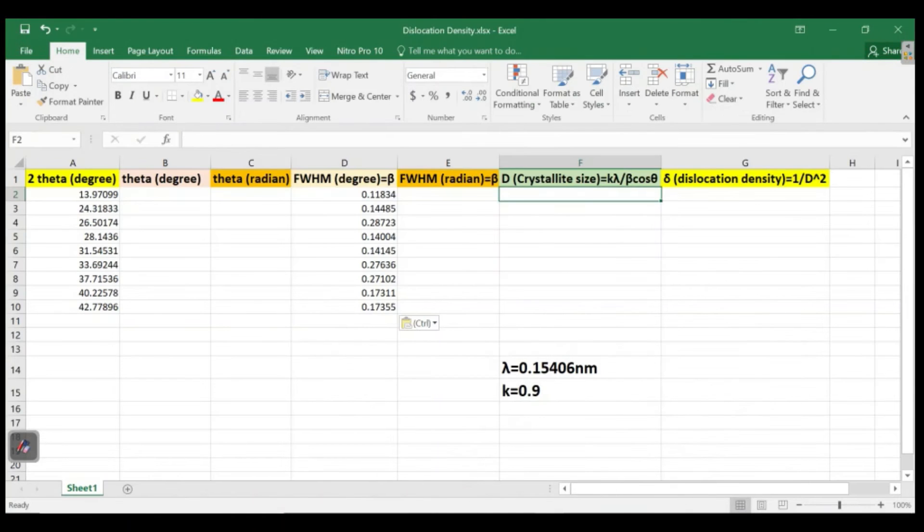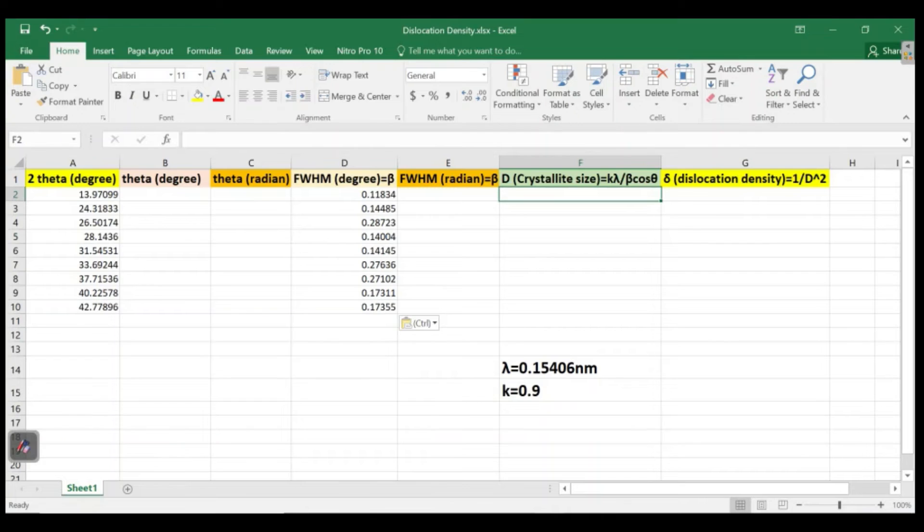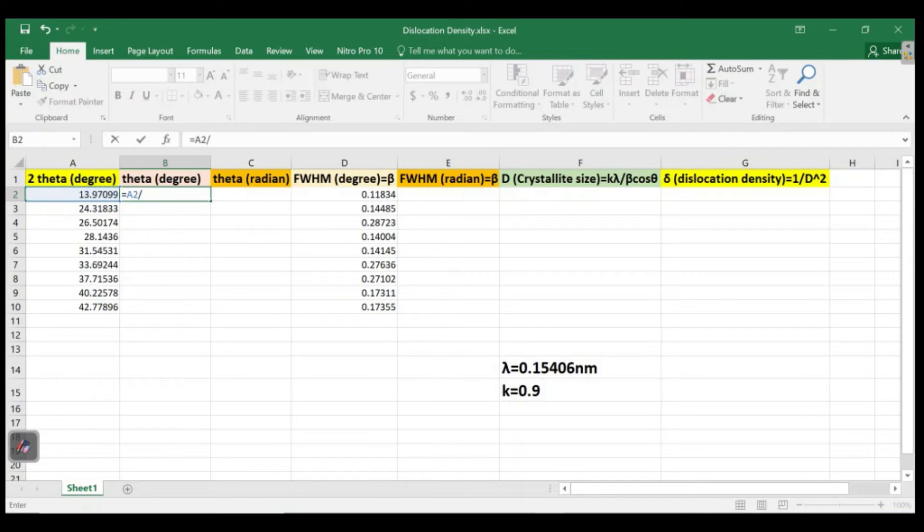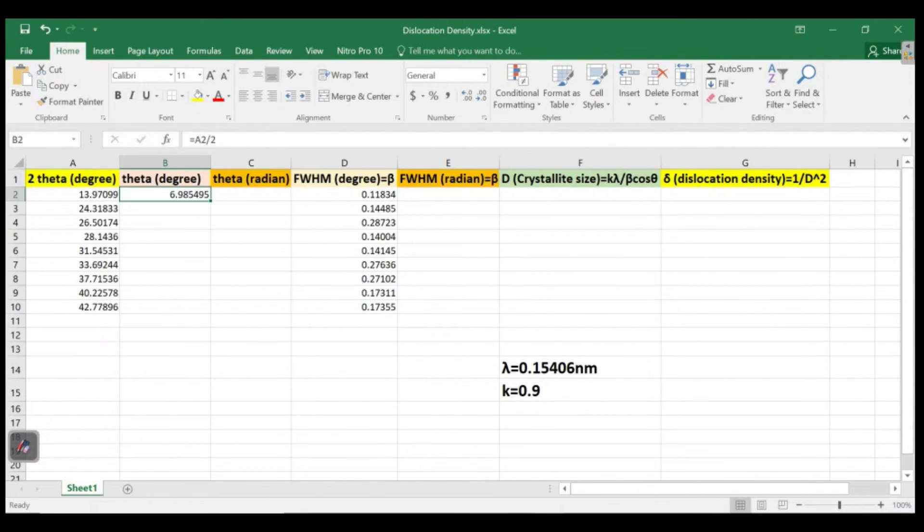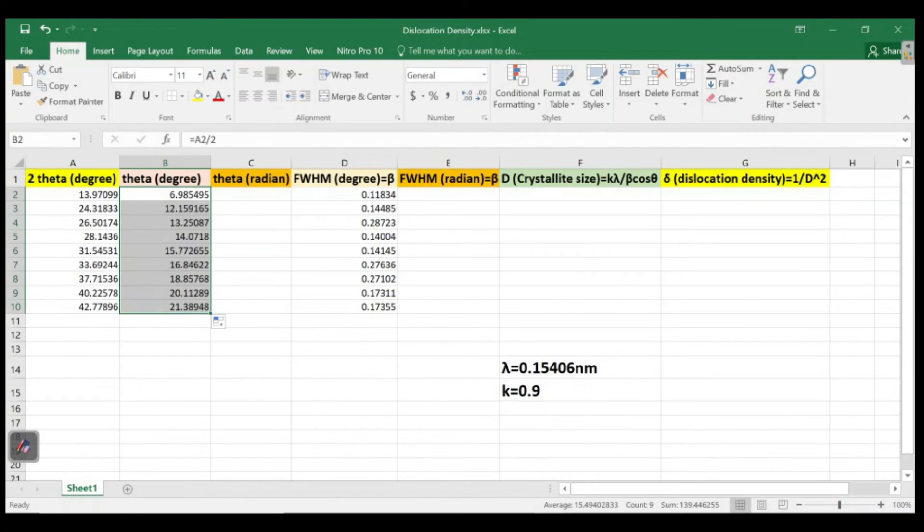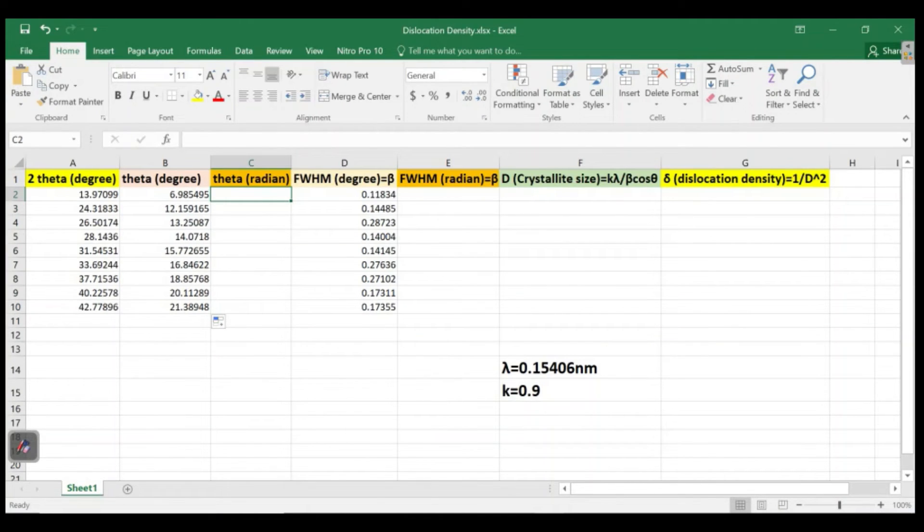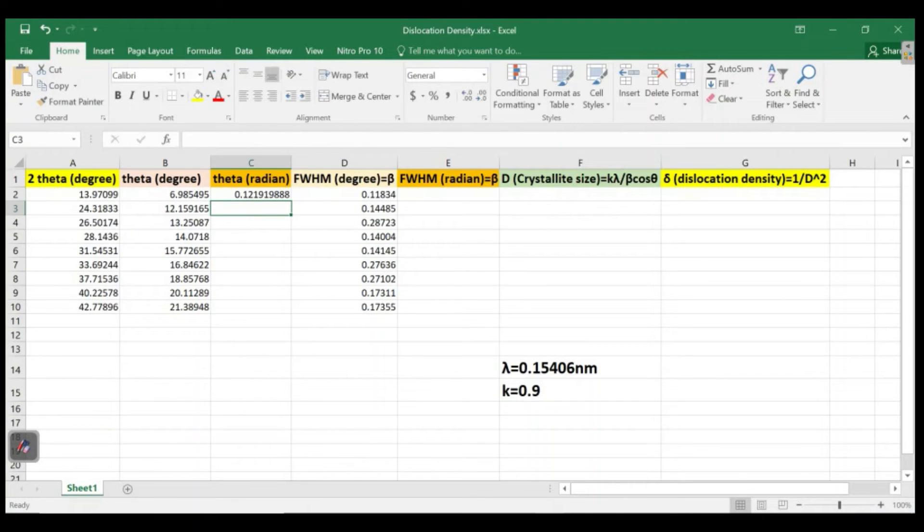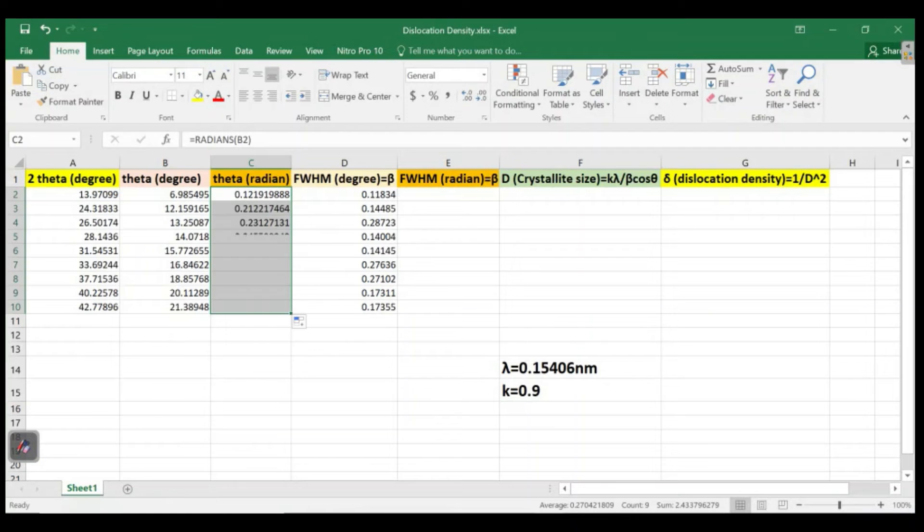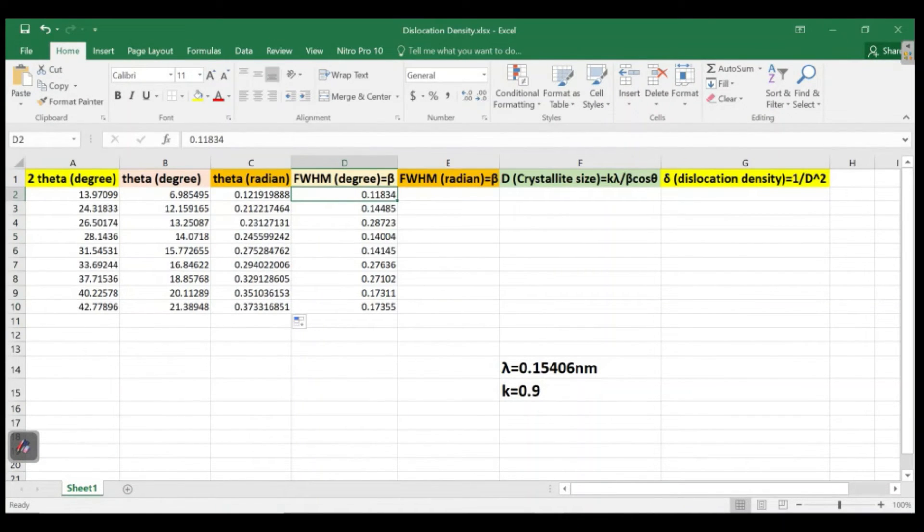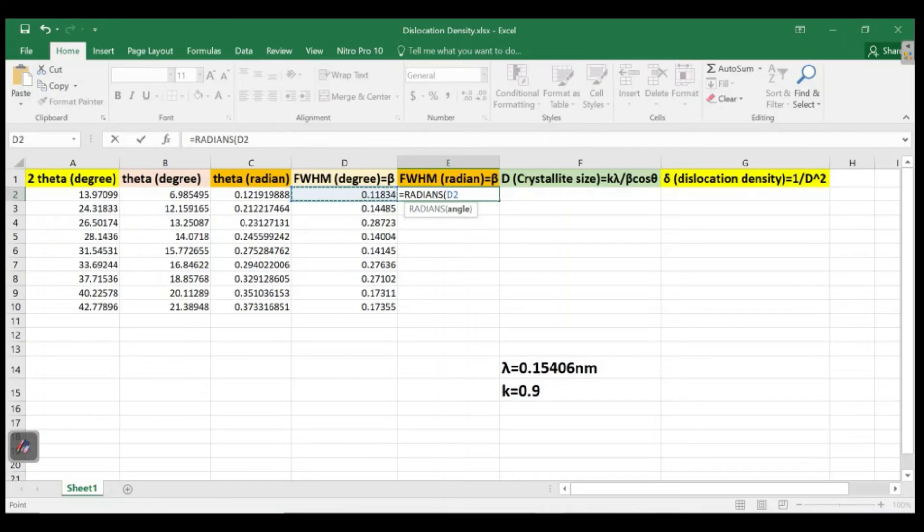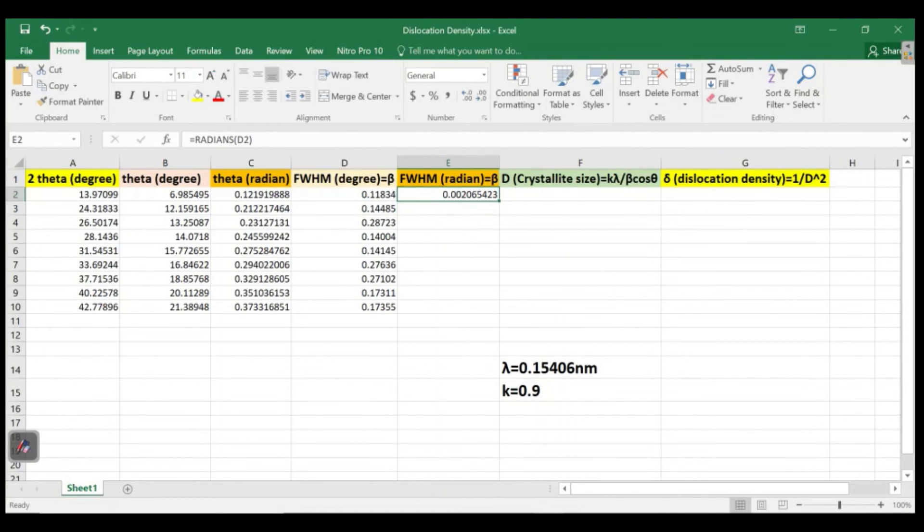This is actually all the background. Now we just need to convert the values over here. Here we just convert this to theta, so this should be divided by 2 so that we can get theta. Apply to all. Similarly, this is in degrees so we should convert it to radians, using the RADIANS function. This is also in degrees, so we should convert this to radians. Apply it to all angles over here.